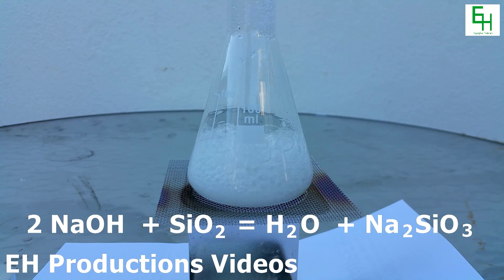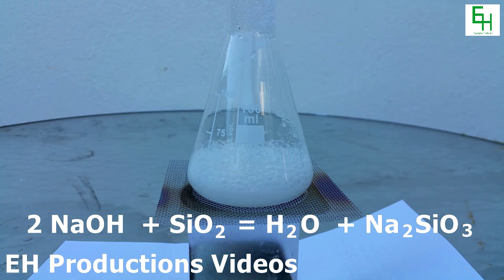As you can see the reaction between the sodium hydroxide and silica gel is very exothermic. And once it gets started it'll keep boiling at its own heat. And we don't need to even use an alcohol burner.